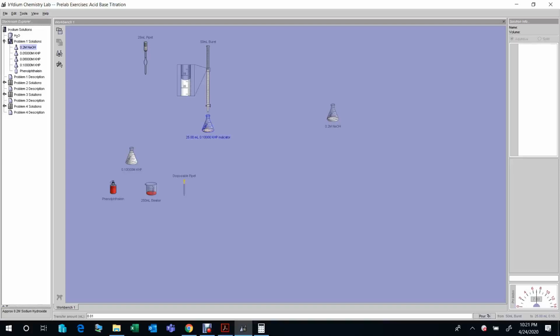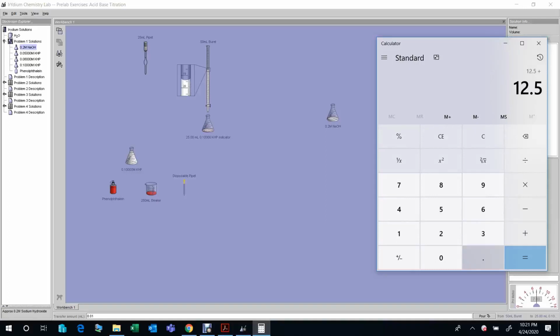You see, the color changed more. Or you can choose this one as the equivalence point if you're not comfortable with the slight color change. And sometimes we can overshoot. That's okay. So we add 0.01. So that is the volume we use to finish the titration, right?